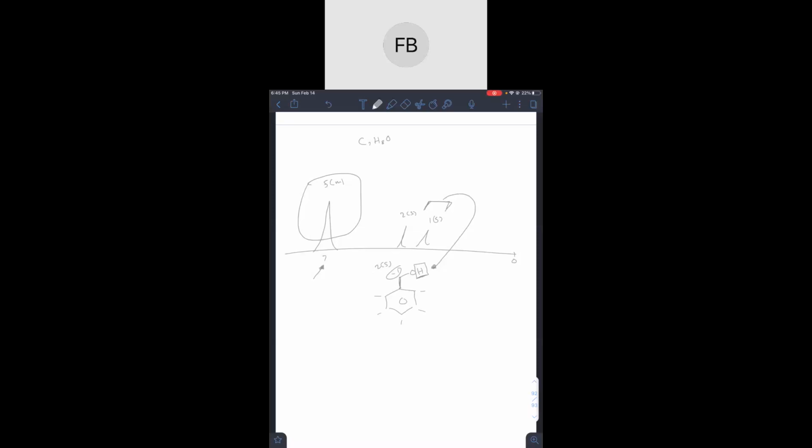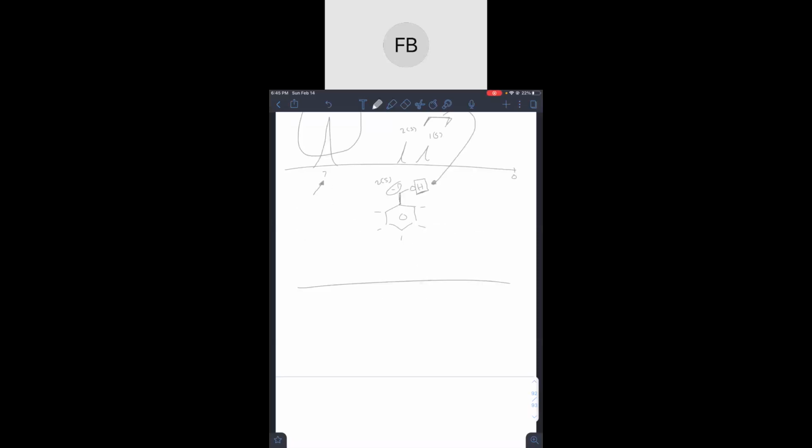Okay, finally. So all the way at the bottom of page 8, and I will just draw it here just so you guys can see, it shows 2 singlets next to each other. So I'll answer your question in a second, Melissa. Okay, so there's a 2 singlet that looks like this. It's very high. Then there is a 1 singlet, which is very, very short and kind of wide. It's not as pointy as the other ones. So this is a classic OH. Anytime you see that little weird bump that's a 1 singlet, it's an OH.